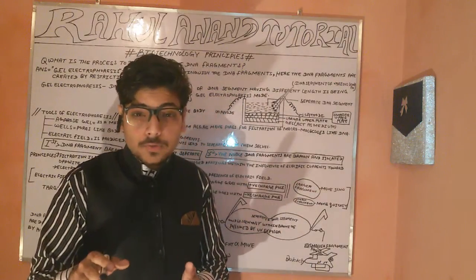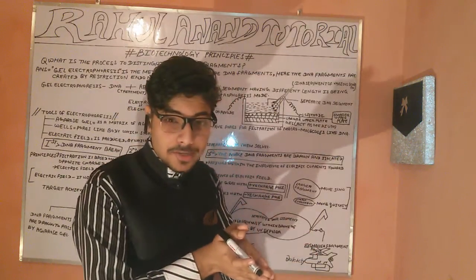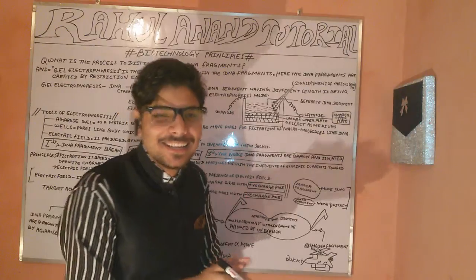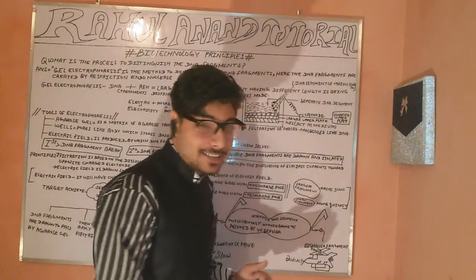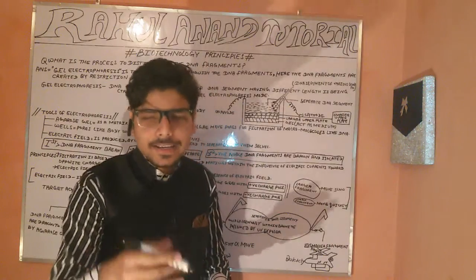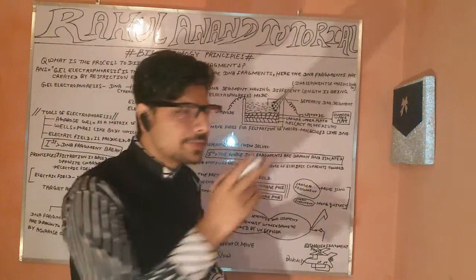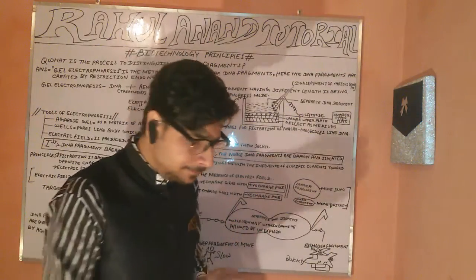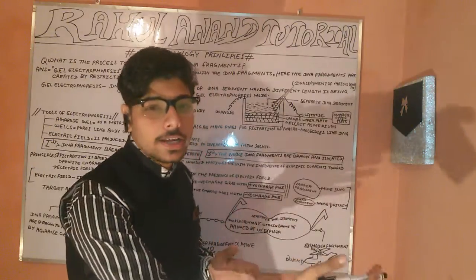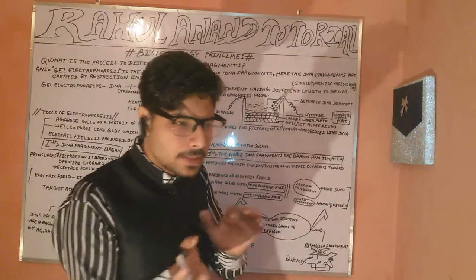So primarily what will be happening? Primarily it will start to break down, and in the second what will be happening? In the second it will start to separate. Primarily breakdown, then separation, then the segregation process. Segregation means it will locate and go to the ideal position with reference to the ideal location, and hence by those processes the ideal DNA fragment is segregated.